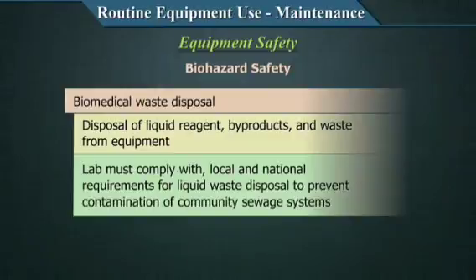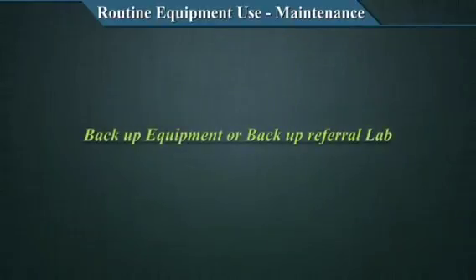All these will include ultraviolet safety, laser safety, glassware safety. These are all considerations of equipment safety, and this also should be thoroughly understood. Please read those modules which are available on this website. So we are done with maintenance now.